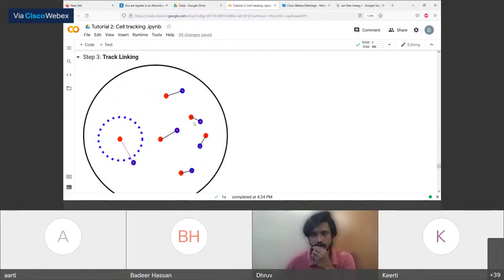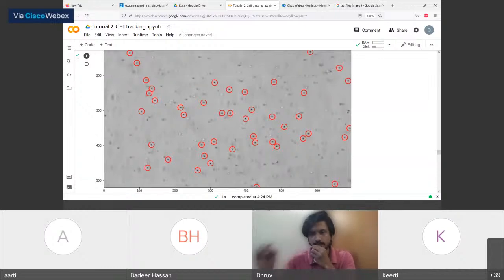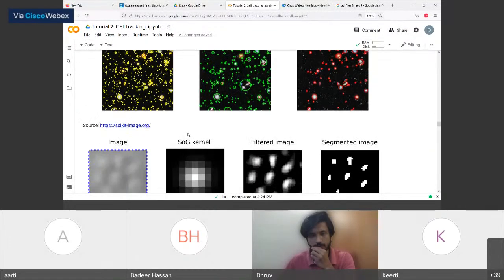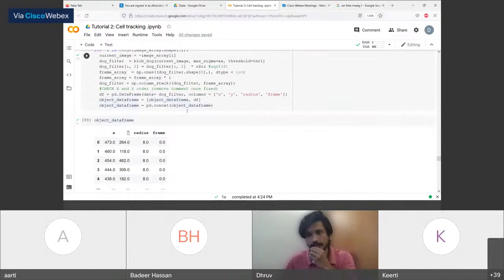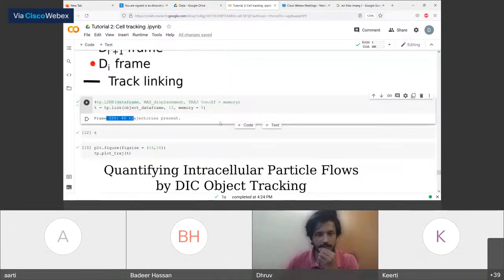Once I get my detections, I can fit a Gaussian to this region and specify the exact peak of this region, the exact peak that corresponds to the deepest point. But it's not very straightforward. For this data it's easy because the profiles are very Gaussian-like, but for some objects it might be difficult. For increasing localization precision or achieving sub-pixel accuracy, you need to do some kind of Gaussian post-fitting to get an accurate estimate of the position.